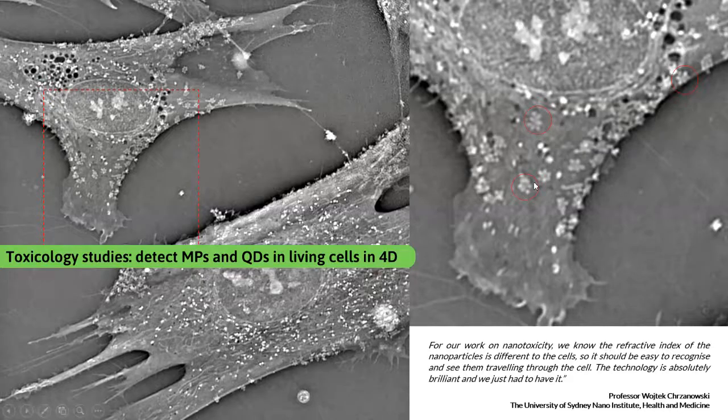So let's move to the next application, toxicology studies. In this case, we are going to speak about microparticles and quantum dots. Here is another reference that I would like to point out, where the professor correctly says the technology is absolutely brilliant and that we have to have it, because it is able to detect the differences in refractive index between the nanoparticles and the cells. This is exactly what we can see in the image here.